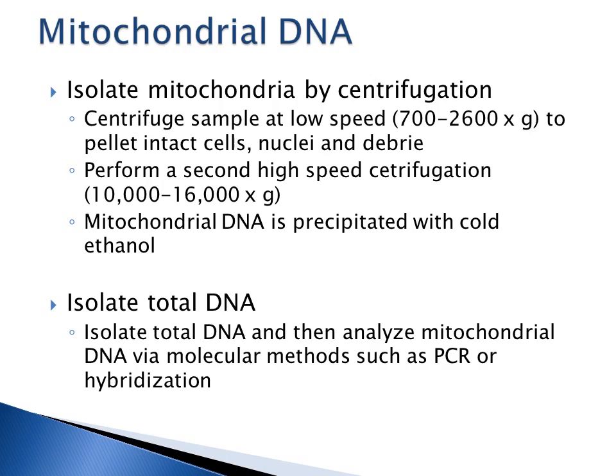However, probably a more common way to analyze mitochondrial DNA is not actually to isolate the mitochondrial DNA. It would be to isolate your total DNA using all of the various extraction methodologies, and then use specific molecular methodologies such as hybridization or amplification that would be specific for your mitochondrial DNA.